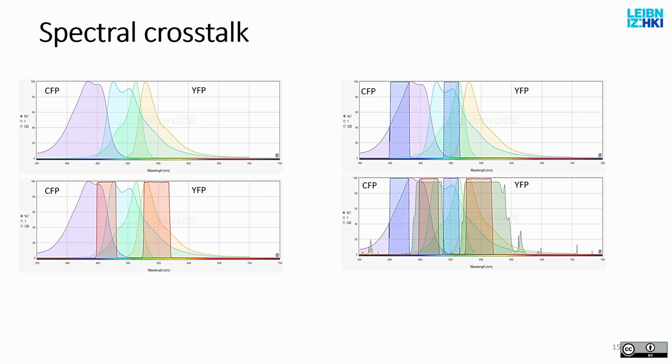Then it puts either a physical slit, a cut in a piece of metal, in front of this resolved light, and selects a certain range of wavelengths for detection, or it uses an optical crystal, where the transmission curve of the crystal can be controlled electronically by setting the frequency of an ultrasound.